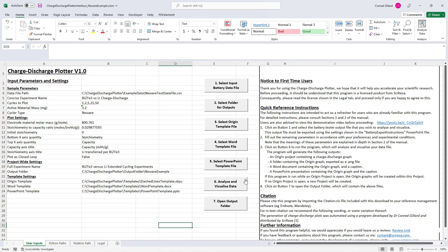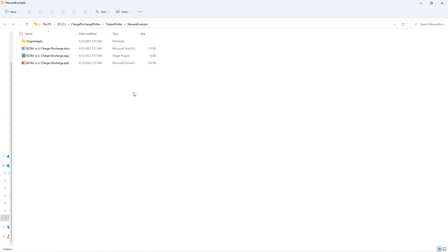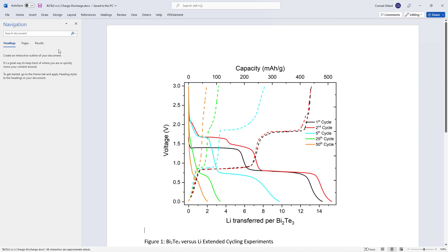Next, click button 7 in order to open the folder containing the generated outputs.